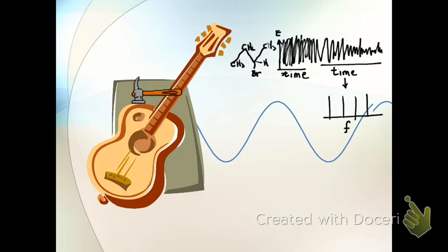So that's the basic premise. What we do is hit the sample with an electromagnetic pulse. That pulse causes a lot of energy to be absorbed by the molecule. Initially, the signal that comes out is very random and noisy, but if you wait a short amount of time, eventually you begin to see the harmonic frequencies of each of the hydrogens in that compound, and then we use a Fourier transform to convert that over to the frequency domain.